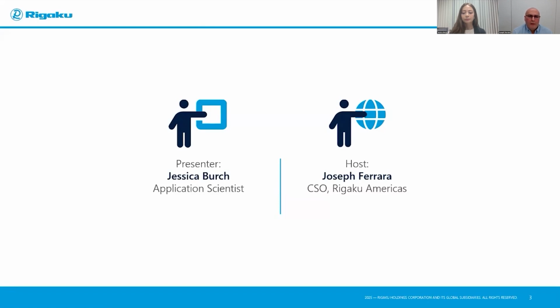This is the third webinar in this series of 6. In this session, Jessica will walk you through the complete electron diffraction process, including sample preparation, data collection, and structural analysis. Jessica will also explain how integrated hardware and software in a dedicated diffractometer streamline workflows, enhancing the efficiency of single crystal structural solutions and making bulk powder analysis by ED a practical approach.